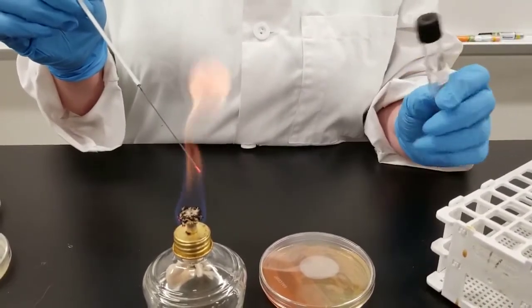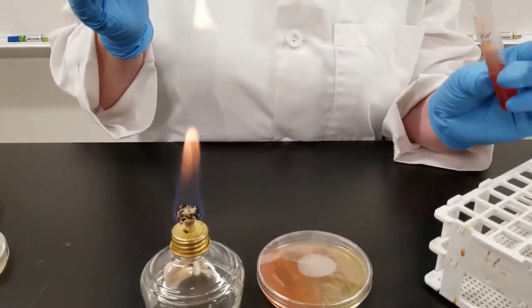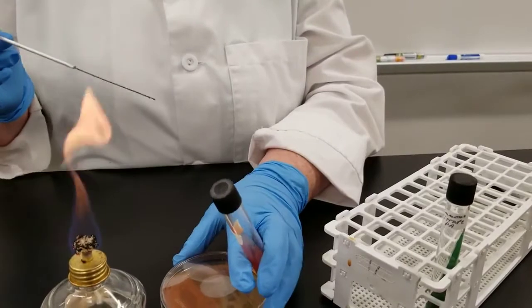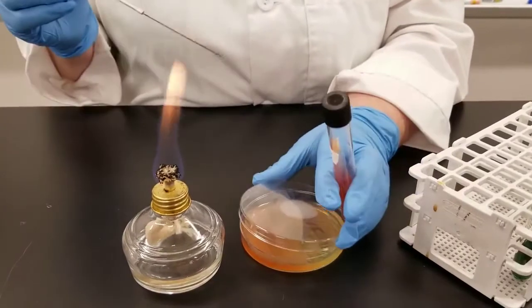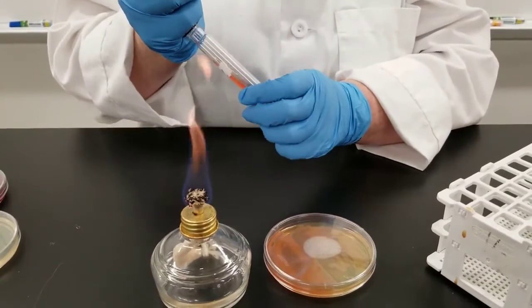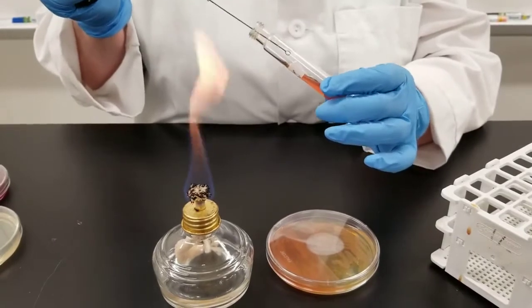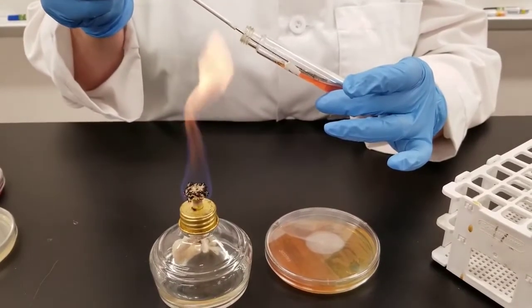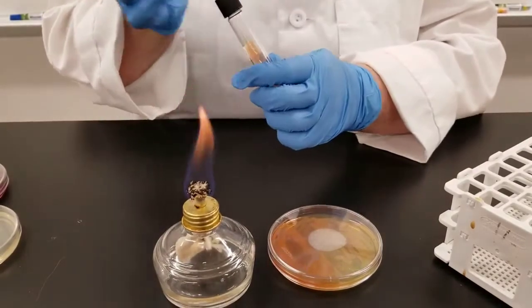The next tube we're going to inoculate is a little different than what you may be used to. This is called the TSI — triple sugar iron tube. We initially will inoculate the way you're used to: pull a sample off our stock plate, flame the loop, and streak up the slant like we just did in the previous tube.